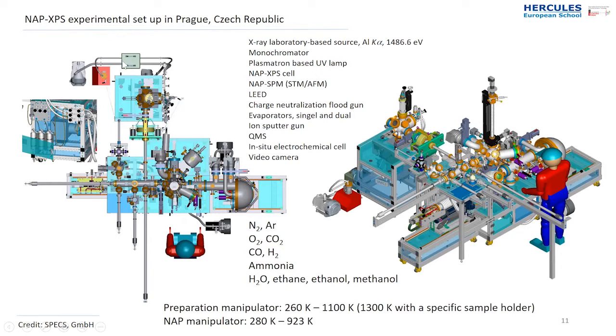As I mentioned, we have a near ambient pressure SPM, scanning probe microscope, that puts together STM, scanning tunneling microscope, and AFM, atomic force microscope. This is quite an interesting combination. SPECS installed this SPM together with our XPS, both near ambient pressure. They told us there are about 5 such combinations in the whole world, and this was the only one in Europe. Probably there was none in the United States at the time, and there were a couple of them in Asia.